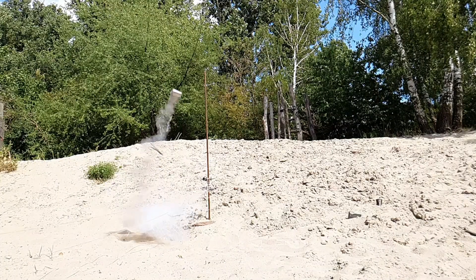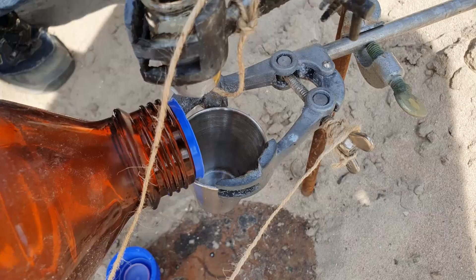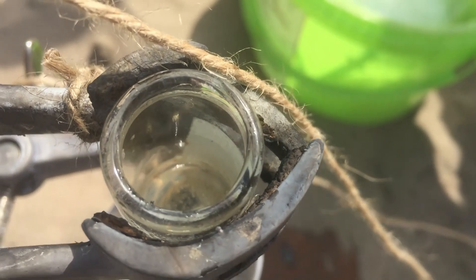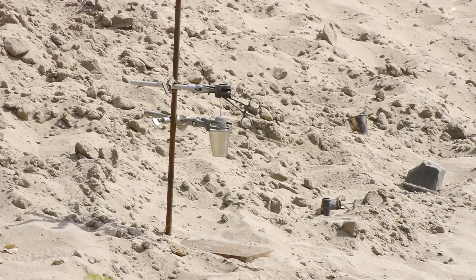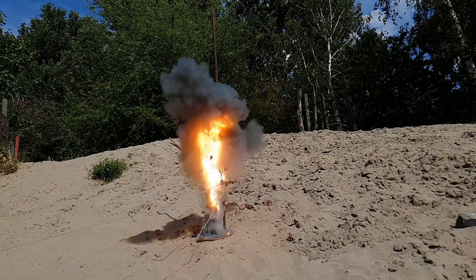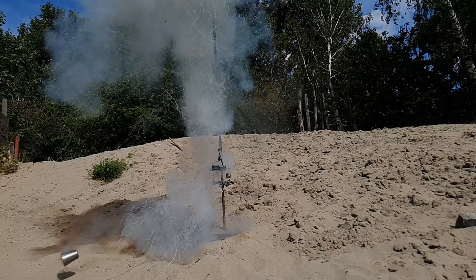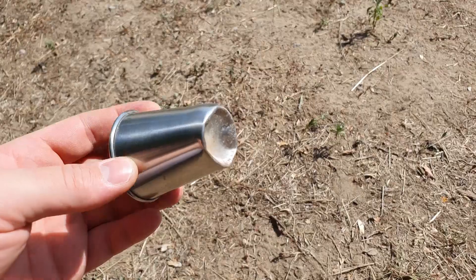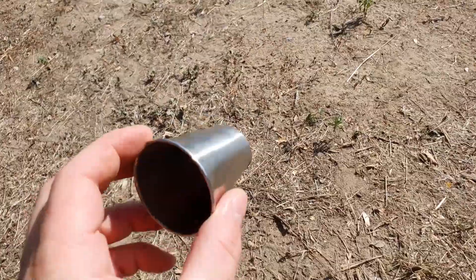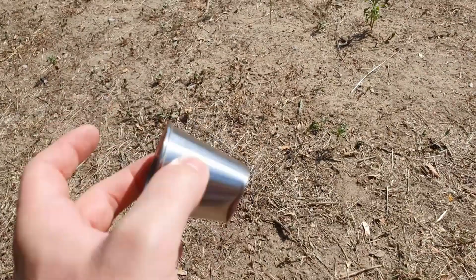Moving to the chloroform, we repeated the reaction with the same amount of cesium. The mixture started smoking and then detonated quite violently. In slow-mo, the reaction still looks incredibly fast. It also dented the steel cup we used as a reaction vessel quite heavily, which shows how violent this reaction actually was.